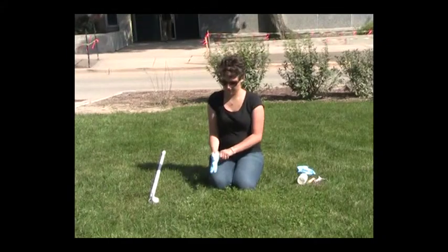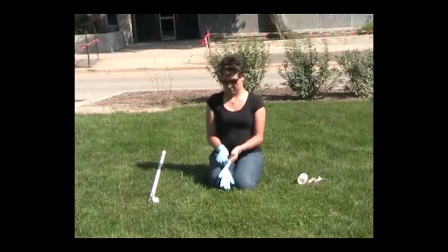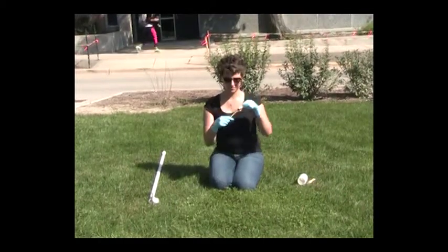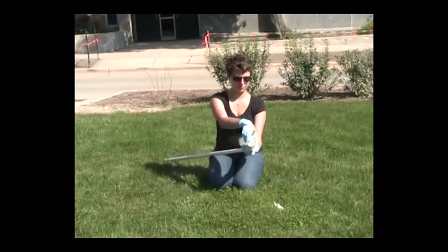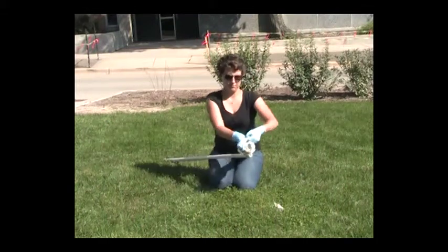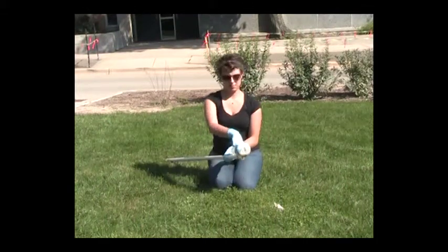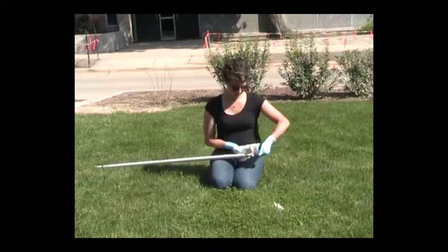Put on disposable powderless gloves. Take your handheld thermometer out of your monitoring kit and place it in a location where it can adjust to the ambient air temperature. Attach the ISCO sample collection bottle to the sampling pole using the large rubber band. Insert the rubber stopper with the vent tube into the sample bottle opening.